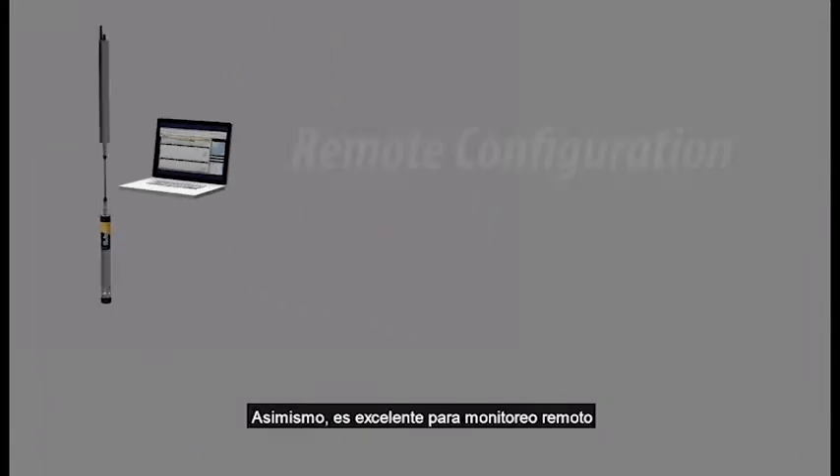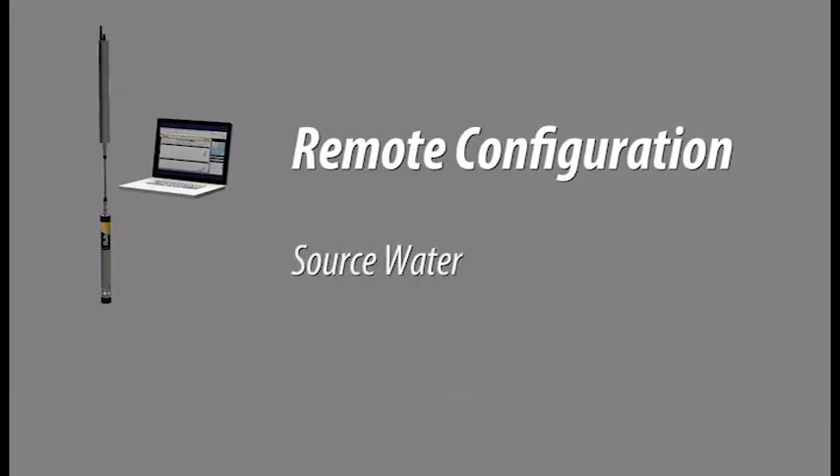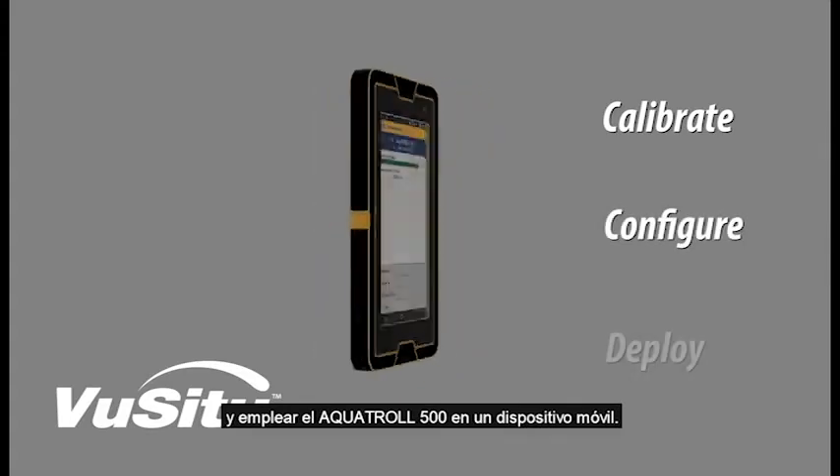It's also excellent for remote monitoring in source water and stormwater applications. With the VuSitu mobile app, you can configure and deploy the Aqua TROLL 500 with your mobile device.